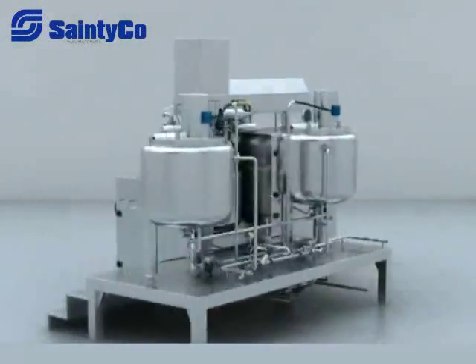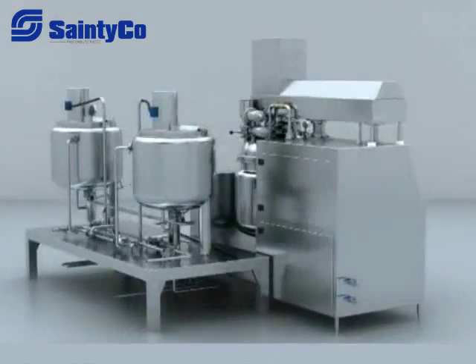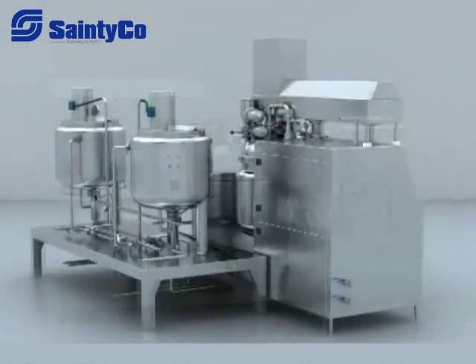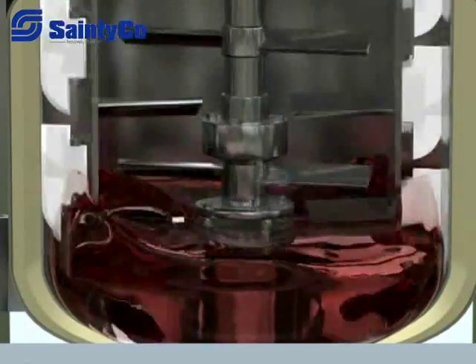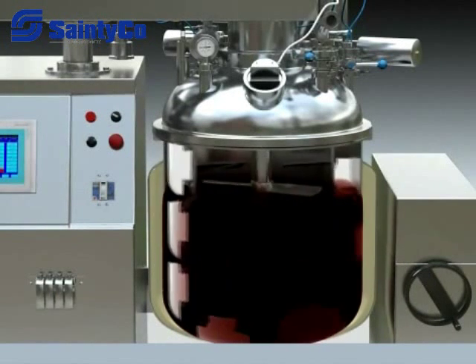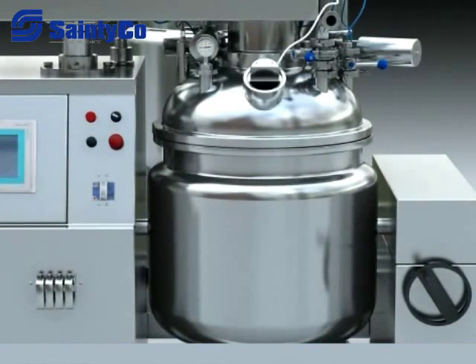The TFZR Vacuum Emulsifier is especially designed to adopt advanced technology from overseas according to cosmetic and ointment production technology. It is used to produce cream products in cosmetic and medicine factories, and is especially used for emulsification of peptic material with high content of solids. The machine has easy operation, steady capability, good homogeneity, high efficiency, solid structure, small volume, high automation level, and is easily cleaned.